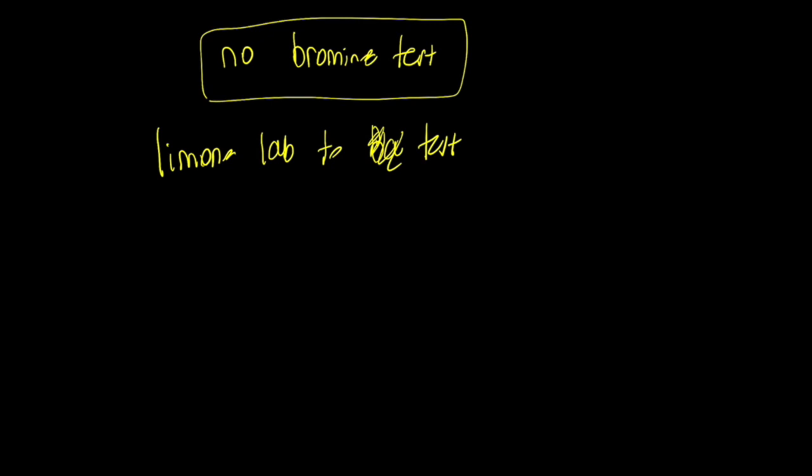Let's see. Okay, so you're supposed to record the amount of cyclohexanol used in grams. So remember how to do that. Look at the bottle. When you do the lab, it's going to have the density on the bottle, okay? The density, the molar mass, all right? Calculate your theoretical yield of cyclohexene.